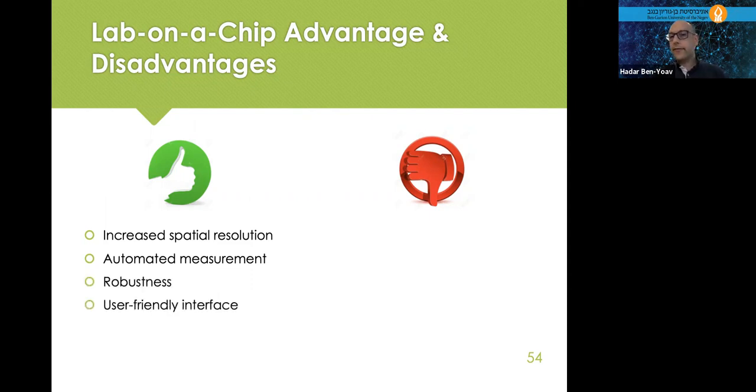Robustness and a user-friendly interface. Everything is automatic, so you just have a screen, and every person can do that at home. Portability and disposability: the cost is very low, so you can make multiple chips, use them one time and dispose of them. And portability, everything is miniaturized, so you can do that at home.